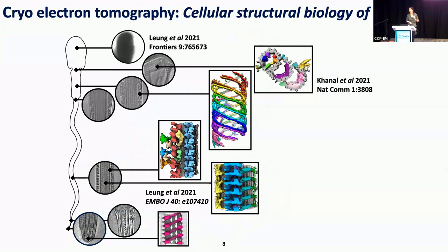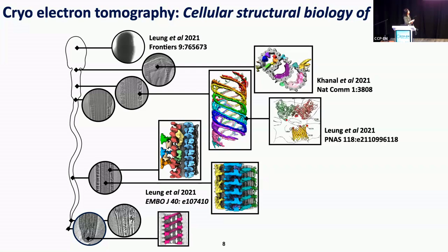But again, we run into this problem that many of these proteins were not identified before. So one of the approaches we took was to combine it also with proteomics, but more specifically cross-linking mass spectrometry. And that worked well for one example, when we analyzed a protein that is on the surface of the mitochondria. But maybe one of the limitations of cross-linking mass spectrometry, and this is also something we did on the whole cell, so we did not isolate anything.